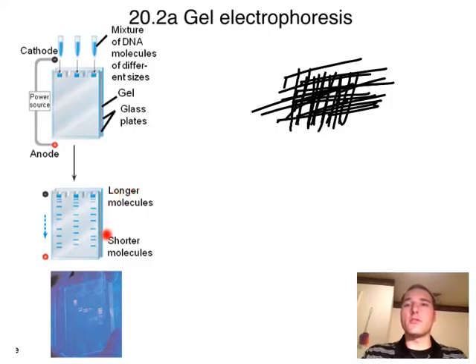But we could look at this, and so when I was doing my bird malaria research, what I knew is I was looking for a section of DNA that was long enough that maybe it was this length right here. And so I'd run a gel and look at the picture, and if I saw a band at this length, then I knew that this one has a malaria, and I amplified the malaria. This one also has a malaria, and I amplified the malaria. This one does not, because it didn't have that band at the right spot. And so I could identify that.